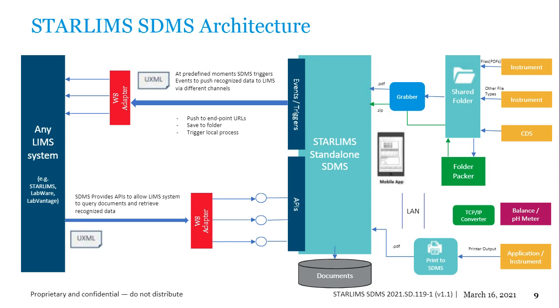Now, there are a multitude of events that can be raised. So whenever these documents are received as part of the SDMS, when they're parsed and either have an error or a success flag raised, when the document workflow has actually finished, when the document is recognized by the SDMS, or even when any revisions are added to these documents in the SDMS, and this goes on.